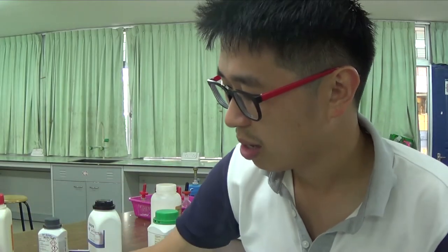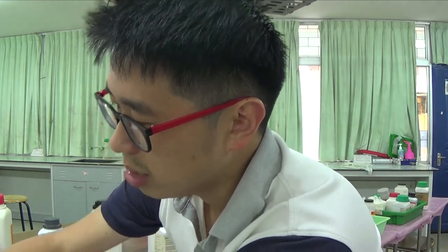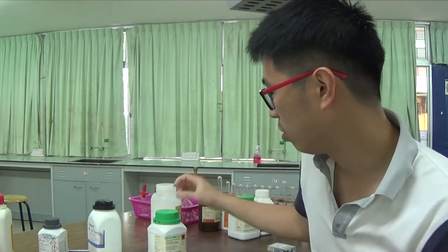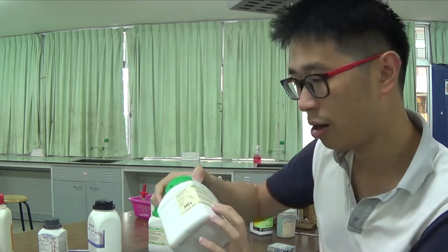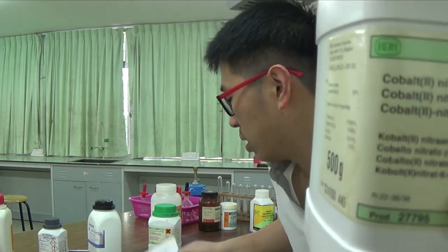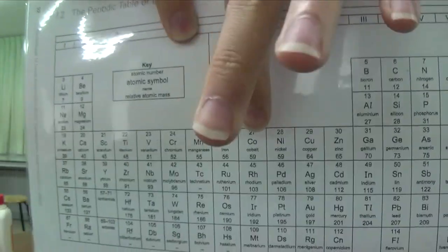So we'll do a bit of qualitative analysis on this in a little bit, and hopefully it will make more sense, okay? So the idea in this tutorial, I'm not doing the qualitative analysis for the test of cations in this video, if you're wondering. In this video, I focus on water of crystallization, because I'm going to do something that will show you the presence of the water of crystallization in this compound. This is cobalt. Cobalt is Co, not Cu. Cobalt is just two positions next. This is copper, Cu. Nickel is here. Cobalt is here, Co.